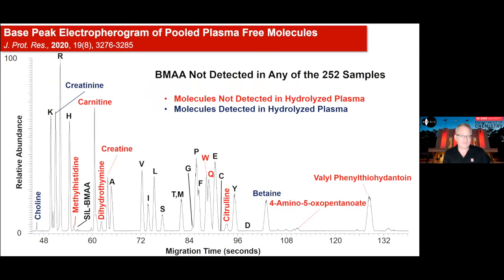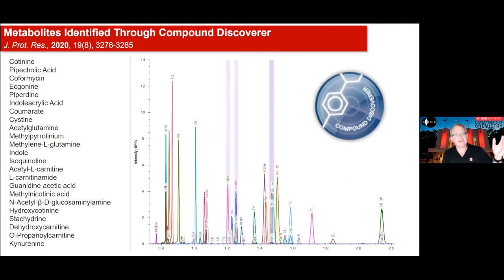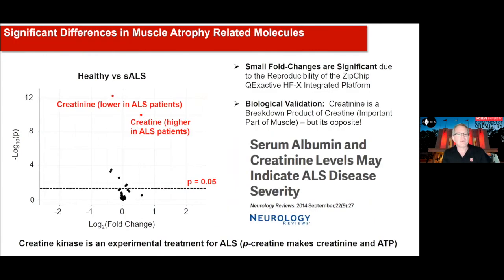And so we tried to look at some of the other data using Compound Discoverer. So in general, we see about 150 metabolites in just a little over 2 minutes. So this is a little bit longer electrophoretic run to get more resolution. But we see about 200 metabolites. We looked at all those different metabolites, and there are other ones on this list that struck our interest in terms of predictability. But one that really stuck out was creatinine and creatine.